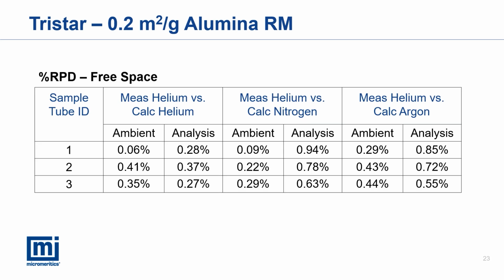Calculated free space values for the reference material analyses were compared with the free space measurement using helium. The relative percent difference for all values is less than 1%.